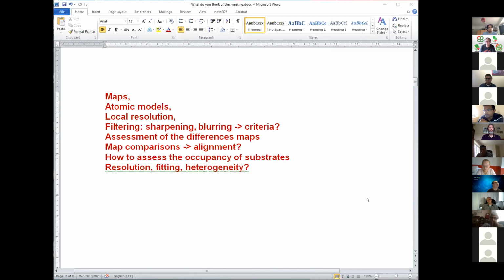This is a vivid, alive system. It moves, and in solution we see many states. That's why we're analyzing different states, and different occupancy of the nascent chain, etc. But with the movement, are we going to align according to the large subunit? Then possibly we will be able to distinguish movement of the small subunit. If we have aligned the small subunit, we know that in the small subunit, the body and the head move with respect to each other. But those movements are much more subtle.